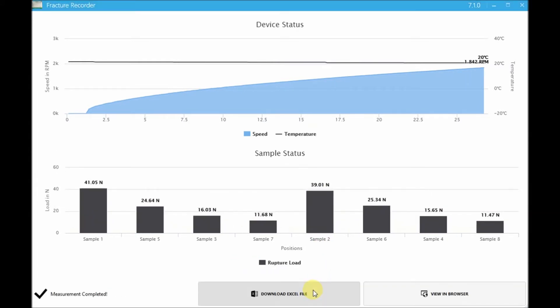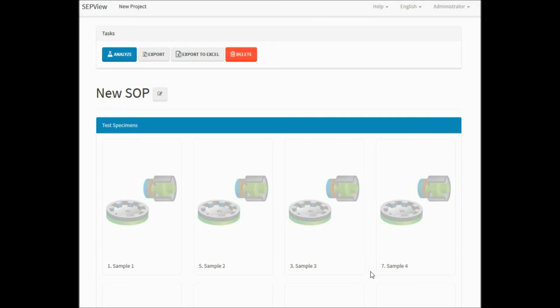We see the final results for every specimen which are shown numerically and in diagrams. We now have several options to continue. Download the measurement as an Excel file or continue in our browser-based view, where we click on the View in Browser option in the fracture recorder or by clicking on the measurement name in the project content page of the Explorer.